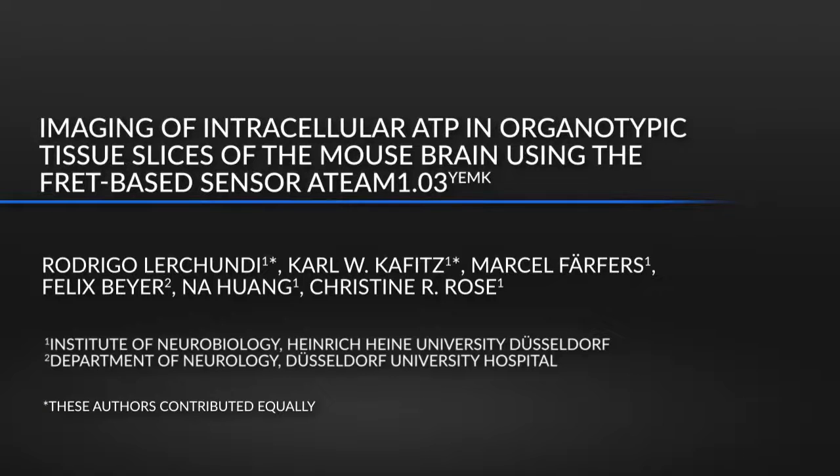Here, we demonstrate how to employ the ATP Sensitive FRET Sensor ATeam1.03-YEMK for dynamic measurements of changes in neuronal and astrocytic ATP levels in organotypically cultured mouse hippocampal slices. The main advantage of this technique is that one can study energy metabolism in living brain tissue in a controlled setting and environment with high sensor expression levels.